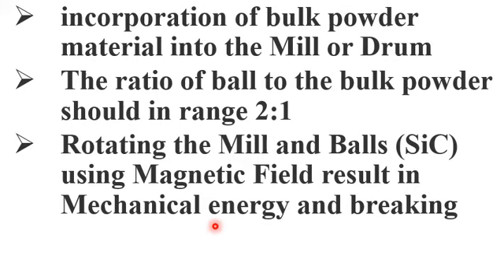We will discuss the impact of magnetic field, how the magnetic field results in cross-correlation and movement of the magnetically and electrically active element inside the ball milling apparatus, but they are not in the scope of this lecture today.